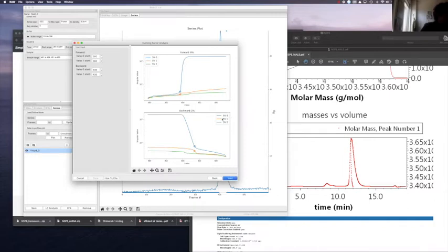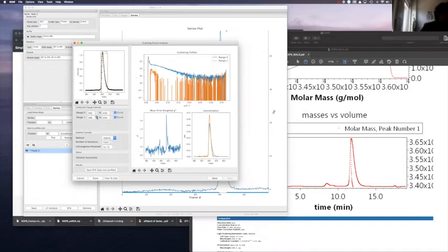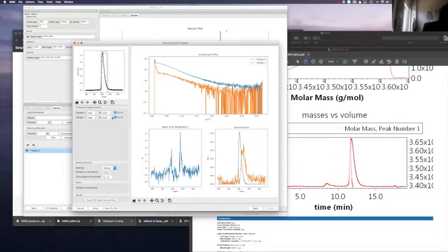And when you do next, you will see that you will not be able to separate those. You can slightly adjust that region of the second peak, make it a little bit bigger. Well, it's very questionable if this is a good solution.